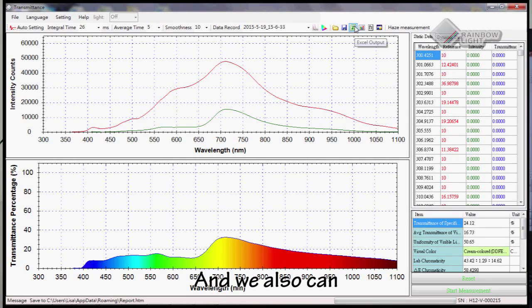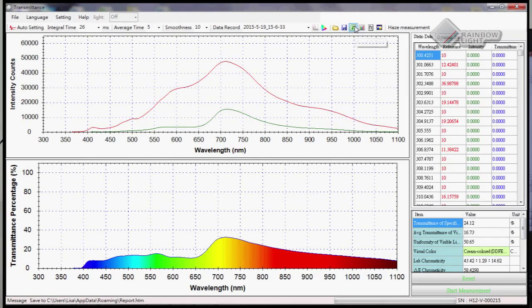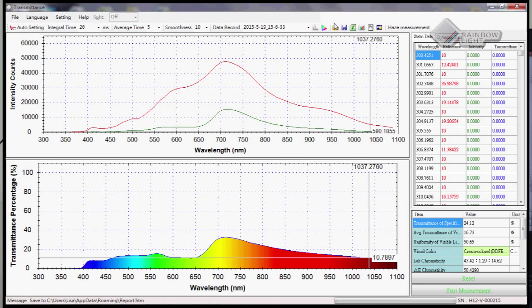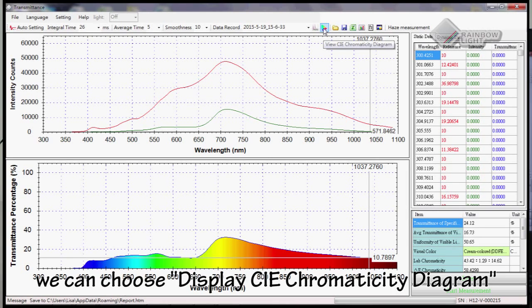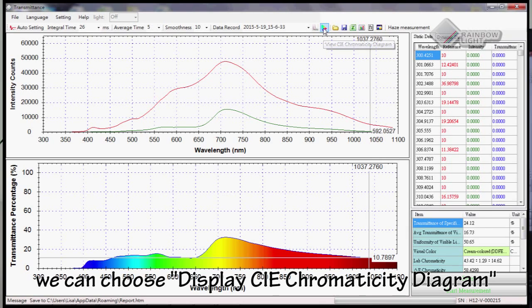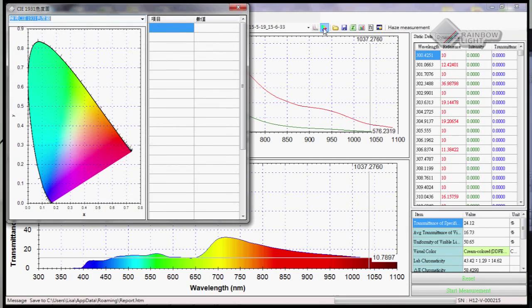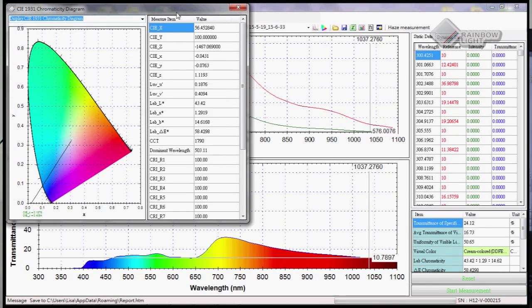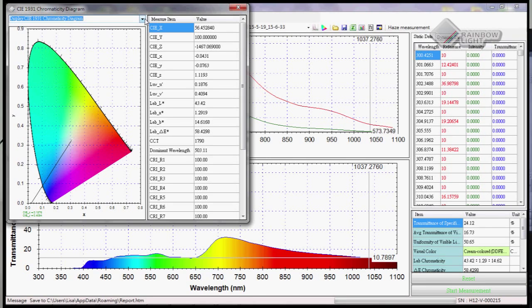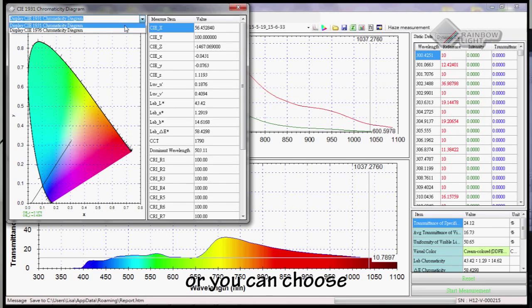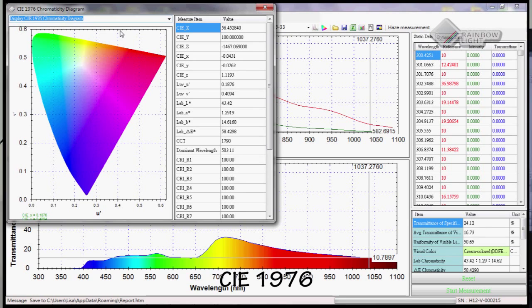We can also export our data to an Excel file. Here, we can choose to display the CIE Chromaticity Diagram. We can see the CIE 1931 or choose CIE 1976.